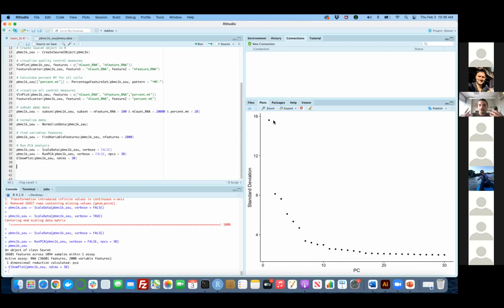Now we have a lot of genes that have a lot of information, but we are technically lowering the dimensions without losing any information about the variance. So the distance between the cells will be the same, but we'll be dealing with 20 dimensions instead of 2000. It's a compressed way of looking at the data without losing much information. We are just showing how to pick those and how to interpret the plot to pick the number.